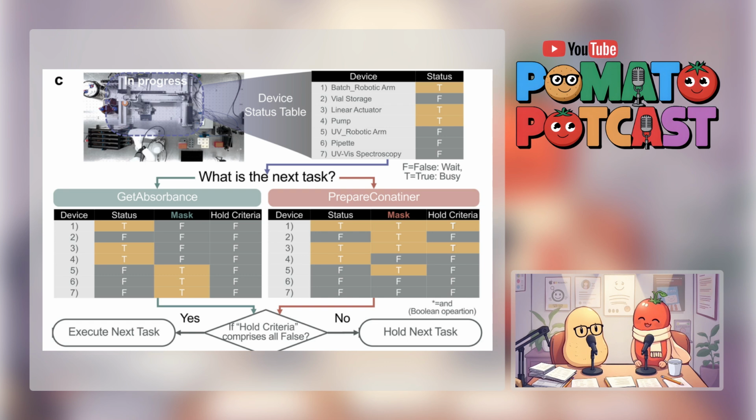So it's like fitting those smaller Tetris blocks to fill in the gaps. You got it. The first batch runs, and then as soon as there's space, the second batch is slotted in. No time wasted waiting for a large chunk of resources to become available. Smart. So it keeps things moving. And this is all part of what makes OCTOPUS so efficient. It's a big part of it, yeah. This closed packing schedule works with the user optimal scheduler we talked about to create a super efficient system.